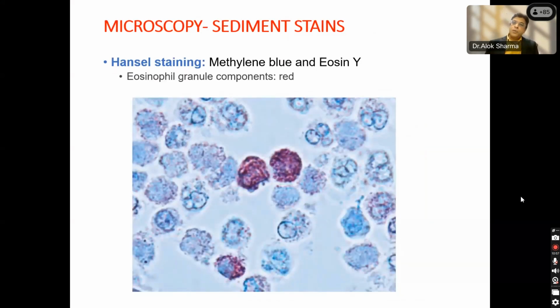You remember, I also spoke about eosinophils, right? It's an important thing, and I gave you an example of one specific clinical condition. You'll get requisitions from the cath lab or the cardiac surgery unit telling you to please look for eosinophiluria. That's the most common requisition you get in those. So in those cases, it is not a bad idea to do a Hansel stain, because you are looking specifically at those cellular elements, and you should identify and quantify them, because these examinations are done serially. Basically, the idea is to exclude atheroembolic renal disease after a procedure.